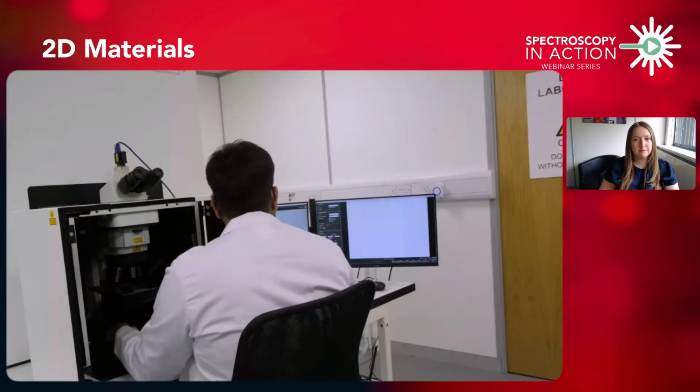So one of the first things we're going to do is place our slide into the microscope. So here we have a slide of molybdenum disulfide placed onto the glass slide. I'm going to now put this into the microscope stage itself, into the holder. Now I'm going to turn on the light source for the microscope.